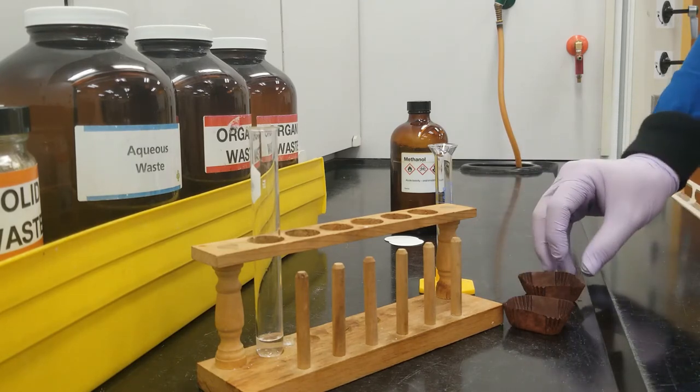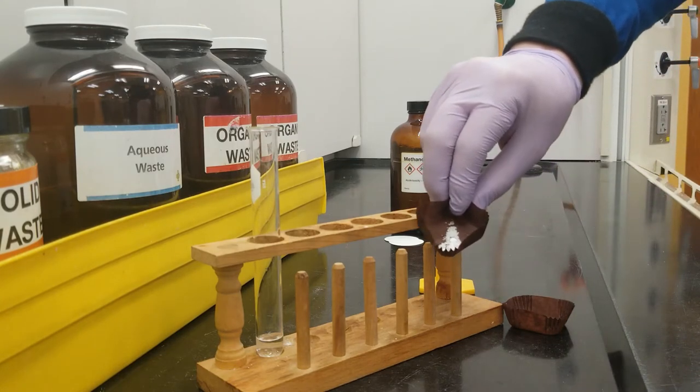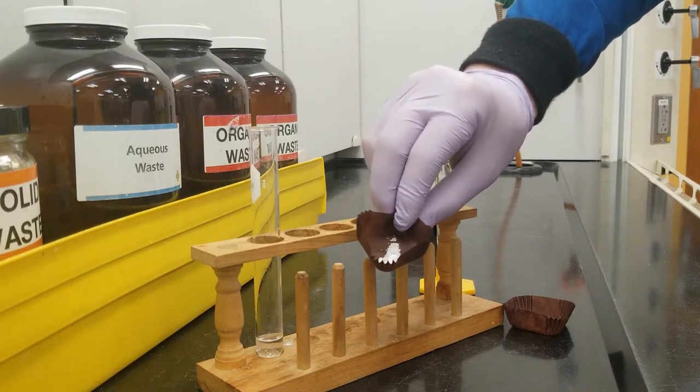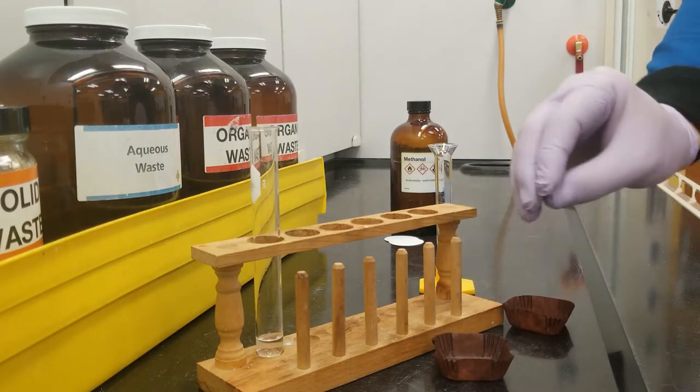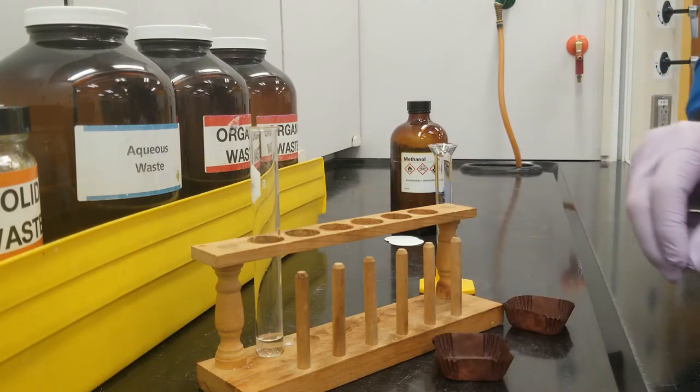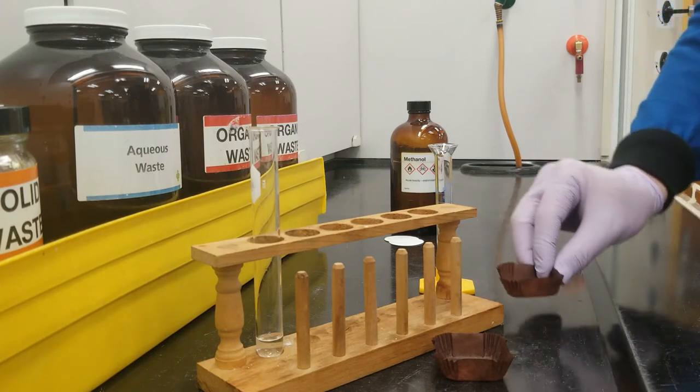Let's start by introducing our reactants today. So here is our benzophenone. This is a slightly granular white solid, and the most important part of this benzophenone today is its ketone group, which we are going to be reducing with the help of some sodium borohydride over here.